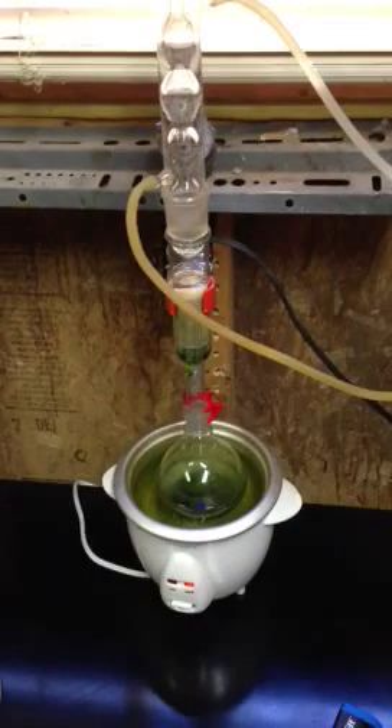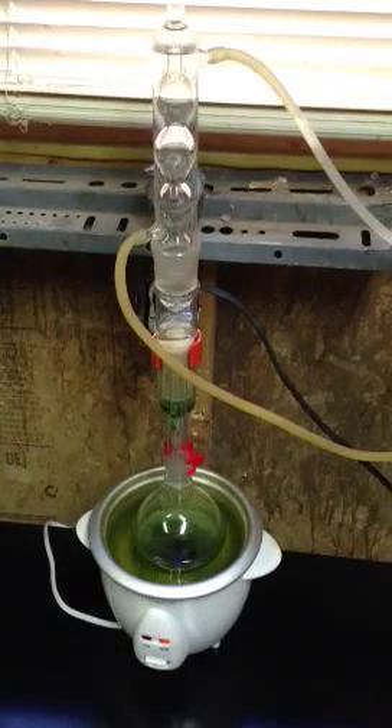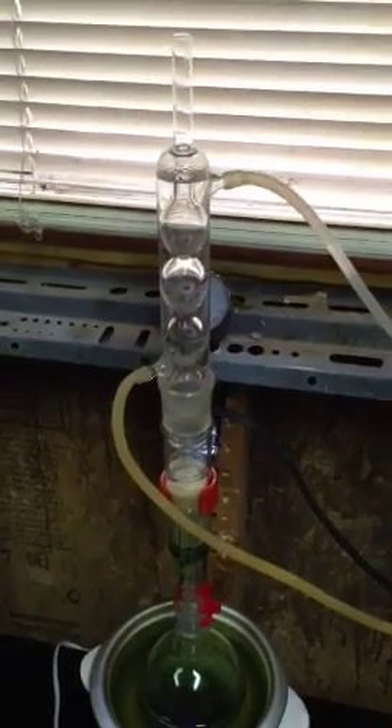Hey guys, just thought I'd put up a quick video of the first run of my new Soxhlet Extractor. Right now I'm just running it with some leaves from outside. Just wanted to see how it works, how it functions. I'll go over the basics with you.